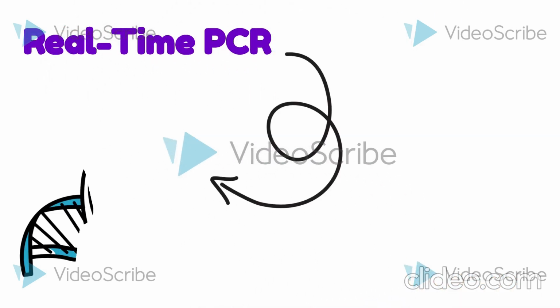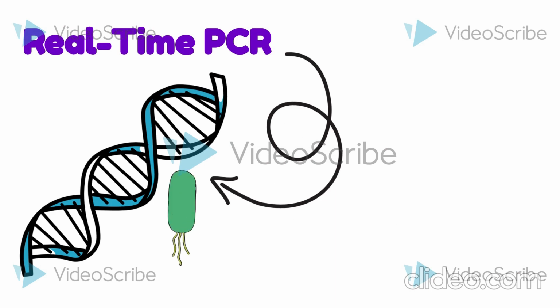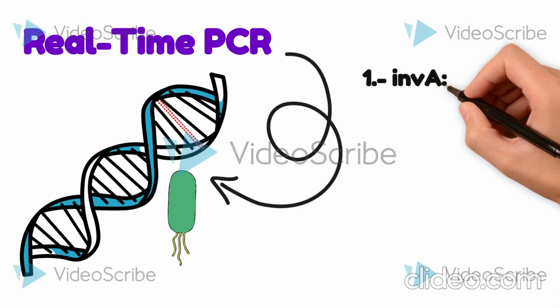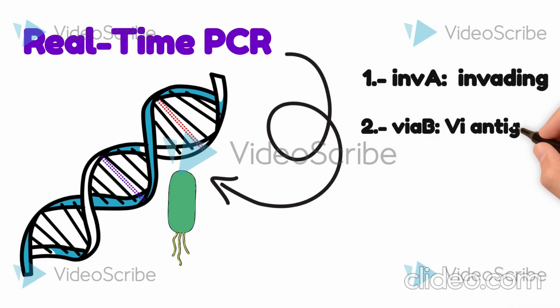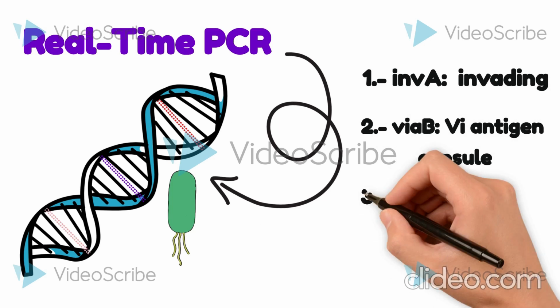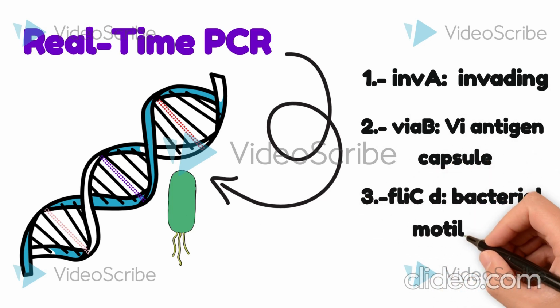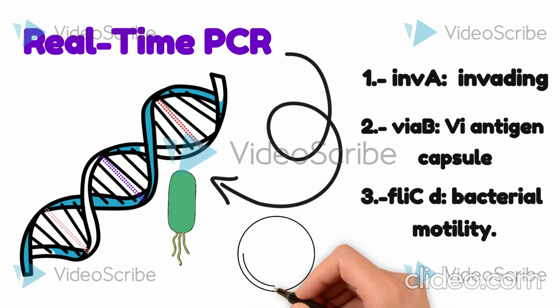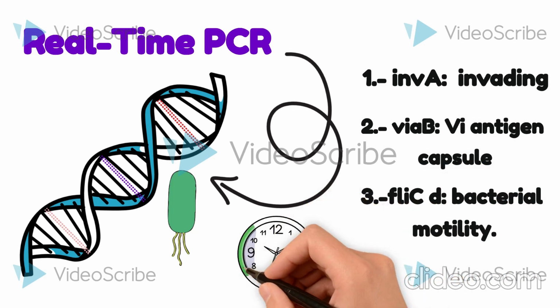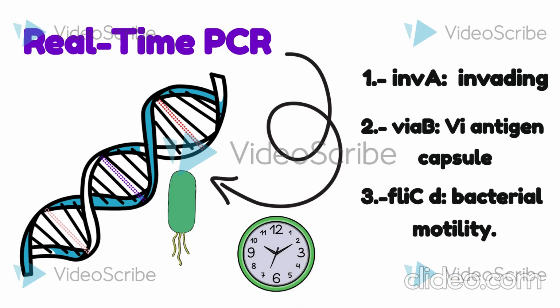Real-time PCR targets the bacterial DNA, specifically genes like invA, essential for invading host cells; viaB, responsible for producing the Vi antigen capsule; fliC-d, involved in bacterial motility. Each of the genes plays a crucial role in the bacterium's life cycle and pathogenicity.